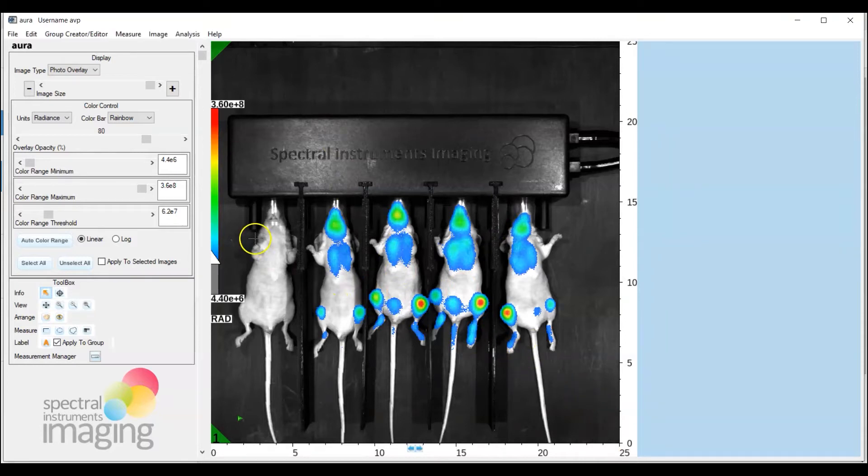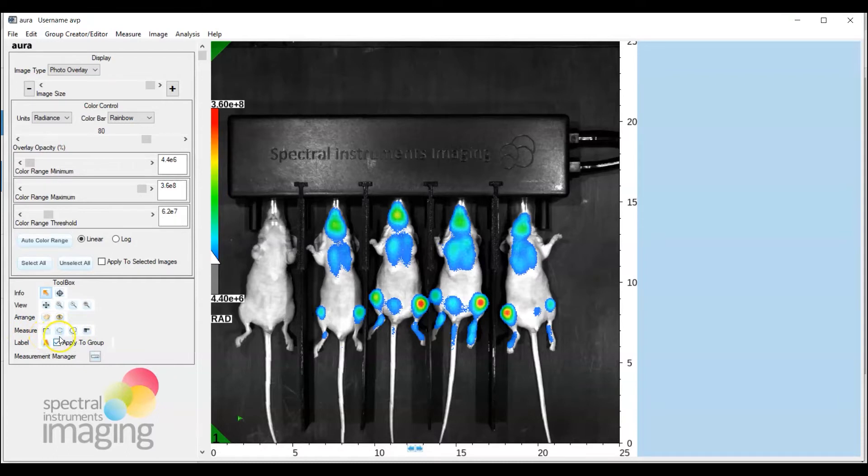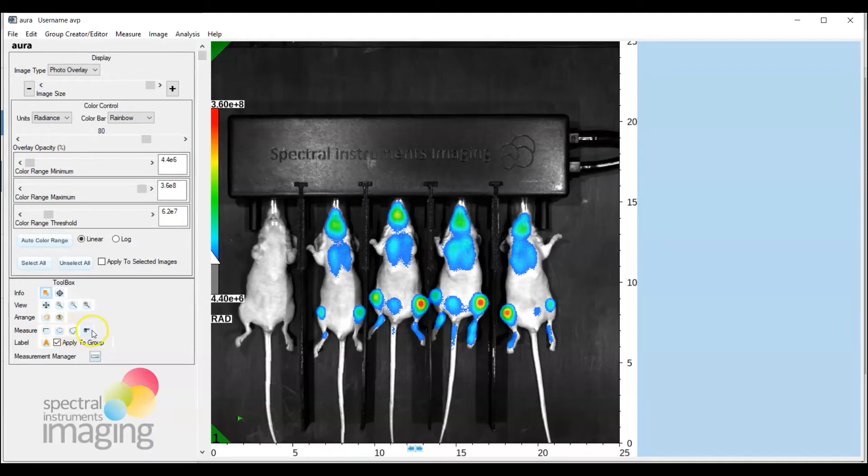Now to draw ROIs simply go over to toolbox and down to measure and you'll see that there are a variety of options for how one can draw the ROI either as a rectangle ROI, circle or ellipse ROI, freehand ROI or as a grid ROI and this is obviously appropriate when you're doing 96-well plate in vitro analyses as an example.